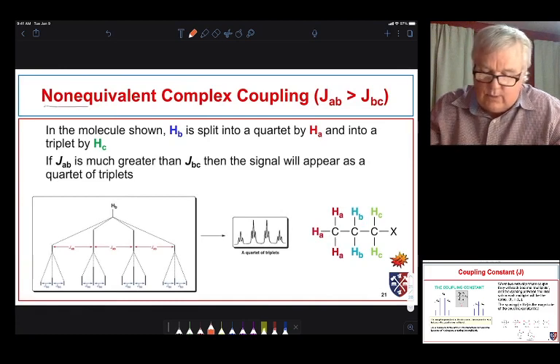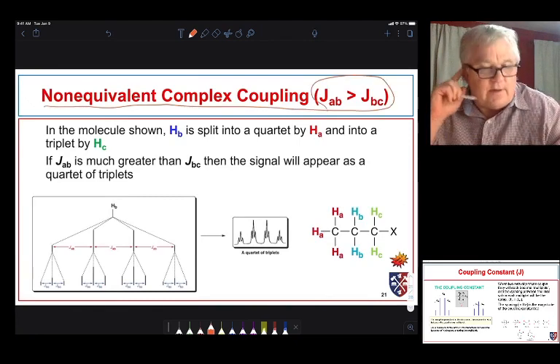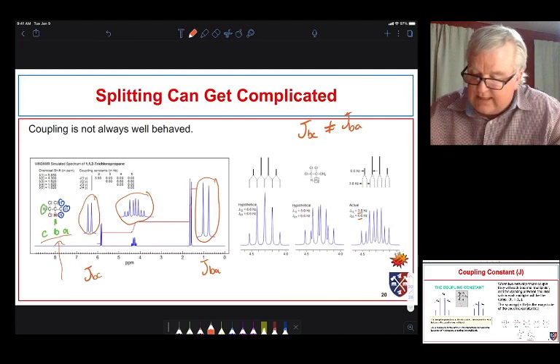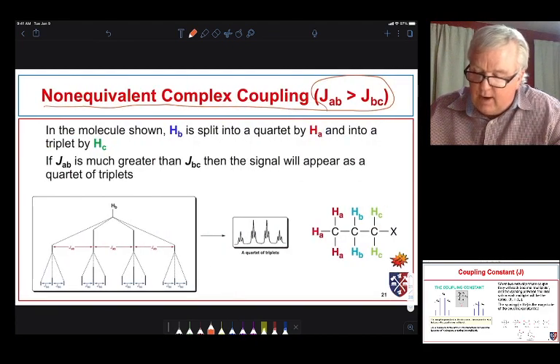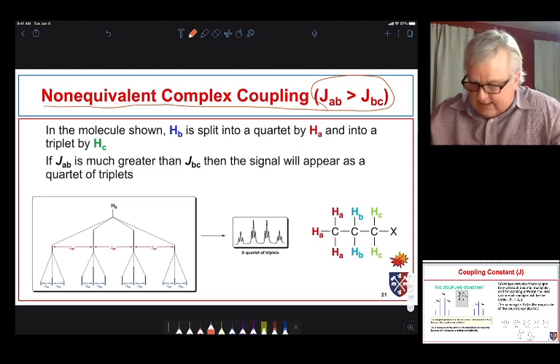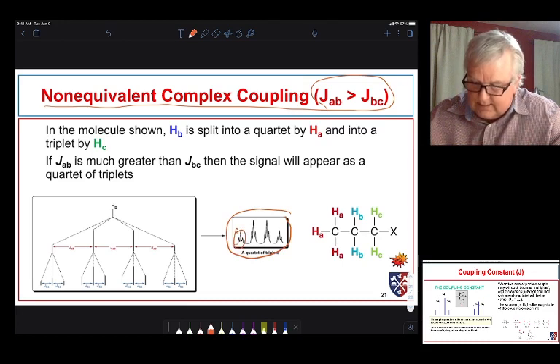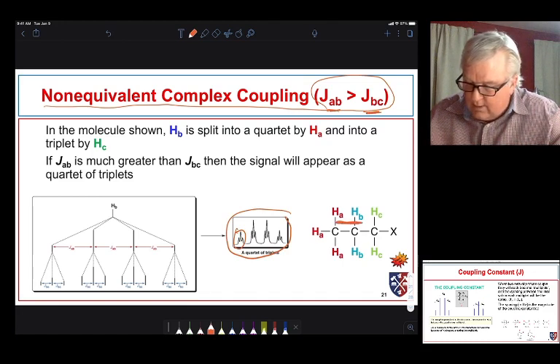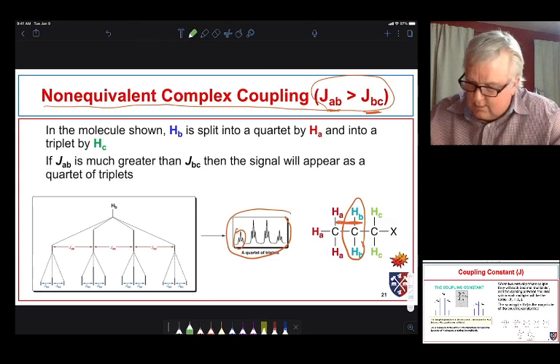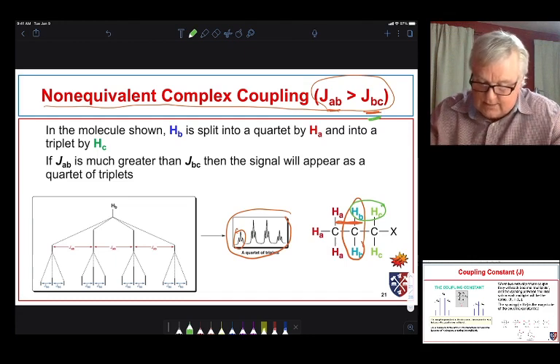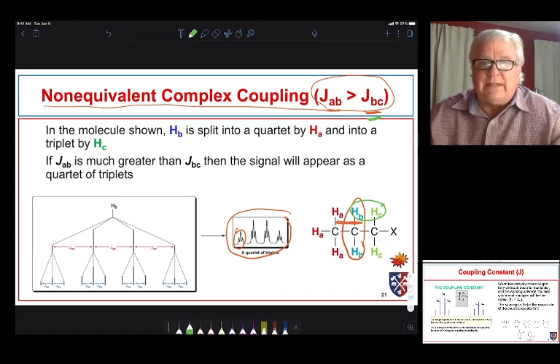We can also have instances where we get some nice-looking patterns, but our coupling constants are very different. Now, this one was complex because, although they weren't equal, they were close. If they're very far apart, we get some nice patterns as well. So, in this particular instance, what we're seeing, look at this, we're seeing a quartet of triplets. And that's because JAB is much larger than JBC. So, JAB is responsible for this signal being split into a quartet, and JBC is responsible for this signal being split into a triplet. So, we see a nice quartet of triplets because the larger coupling constant spreads them out and the smaller coupling constant spreads each of those individual ones.